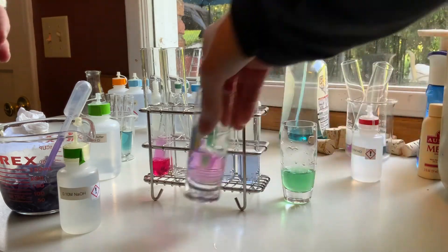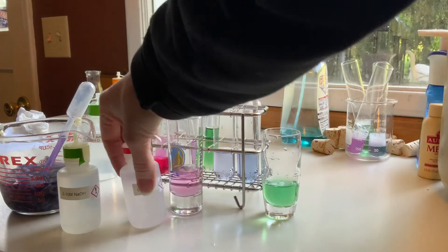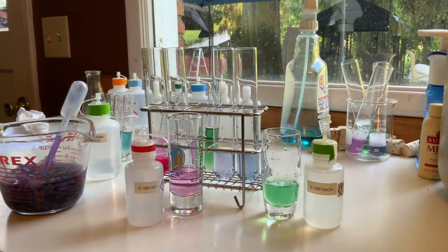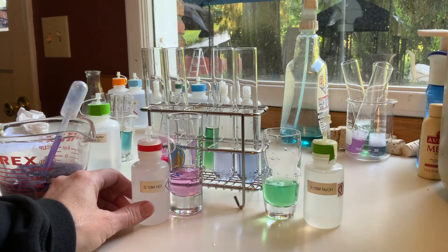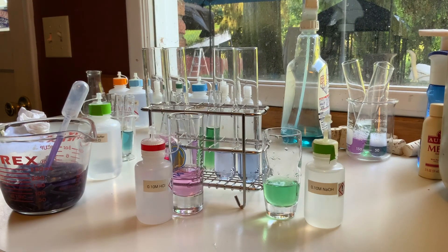Take a look at that — these ones are both buffer. This one had base and this one had acid added. Here's the water — acid added, base added. I think that's the whole lab. The rest is post-lab.